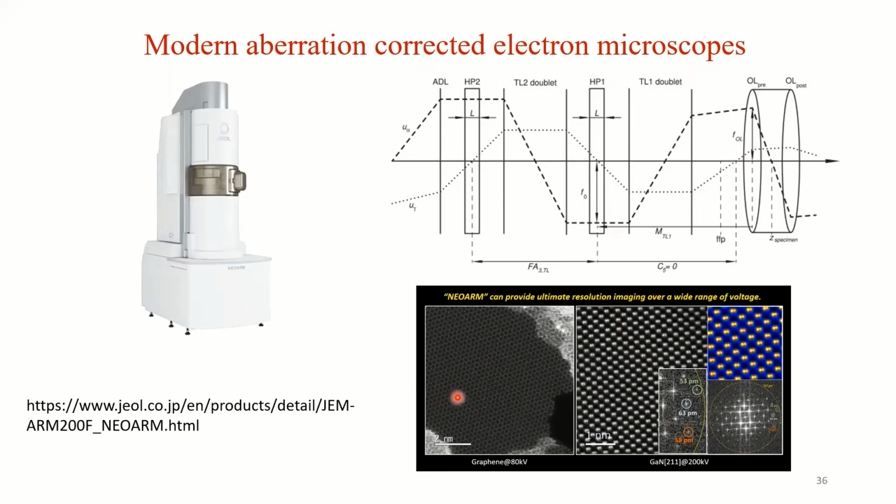And then you have the information limit. Beyond that, you cannot resolve anything. So basically, you have a Young's fringe experiment to see the information limit, but it's not very good for measuring the information limit. So people have suggested some more approaches like tilt series beam or Zemlin tableau, etc.